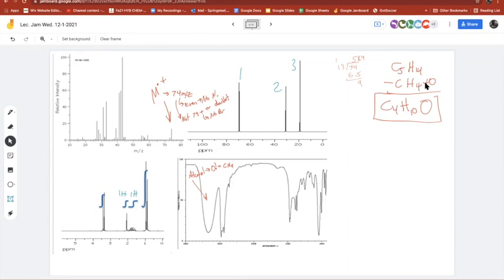Be 2 hydrogens, yep. And if that's 2 hydrogens, does this look like the rest? So I have 10, that's 2, 3, 4. Does this look like 6 hydrogens? Yeah, I could see that being 6 hydrogens. I think this formula looks good. 4 carbons, 10 hydrogens. Yeah, and I'm feeling like an isopropyl group here because I need to have like a 6 hydrogen doublet here.